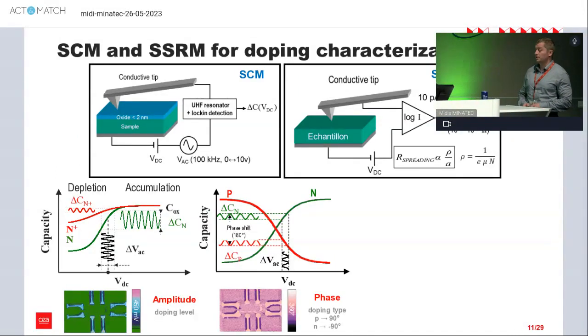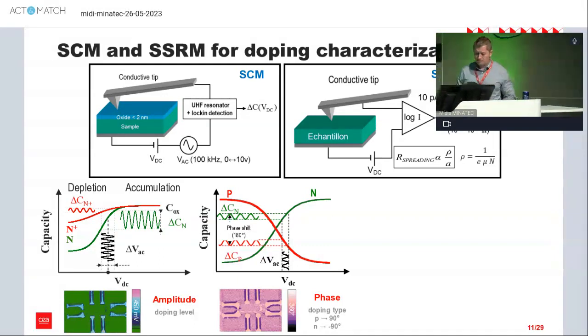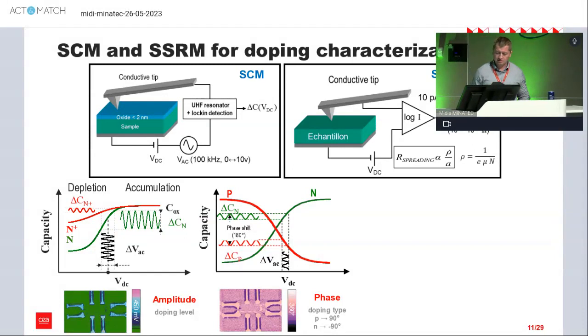So now I show several examples of electrical characterization. I will start with electrical characterization in contact mode. So the first example on the right is rather simple. It's scanning spreading resistance microscopy, where we apply a VDC bias between tip and the surface, and detect the current passing through the sample and through the tip. And from this information, we recalculate resistance. So from this experiment, we can already have information linked to the material, but also to, for example, doping.